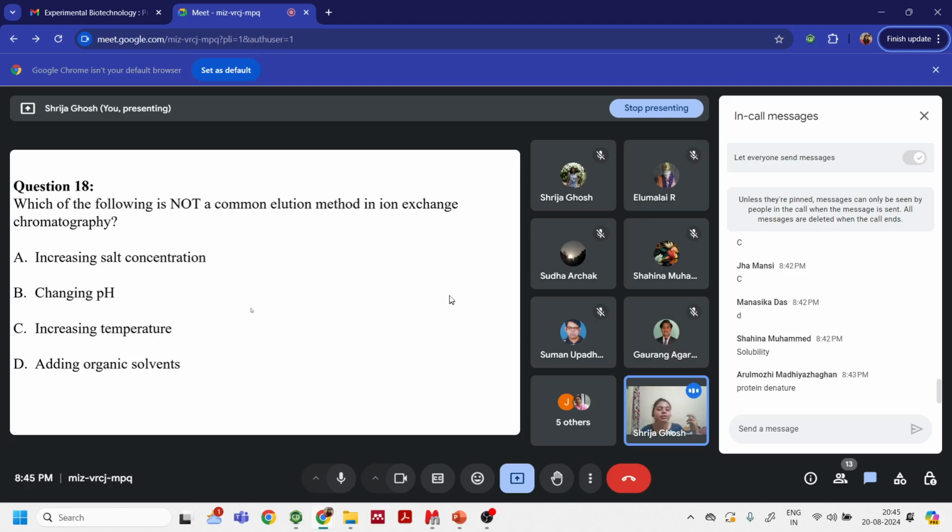Most proteins are globular, which has a hydrophilic outer part. If it has a hydrophilic outer part, it will like to be in an aqueous environment. So it does not like organic solvents that are non-polar, that are less hydrophilic than the aqueous environment. That is why they denature: they cannot be in that solvent, and they try to unfold themselves to expose the hydrophobic part so that they can interact with the organic solvents, because the hydrophilic outer shell cannot interact with them.